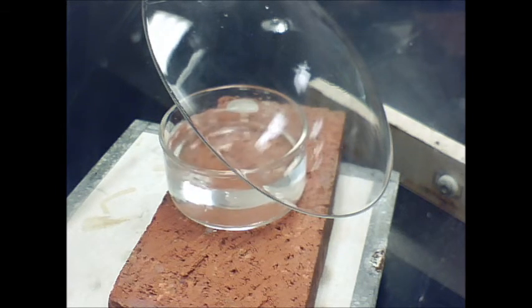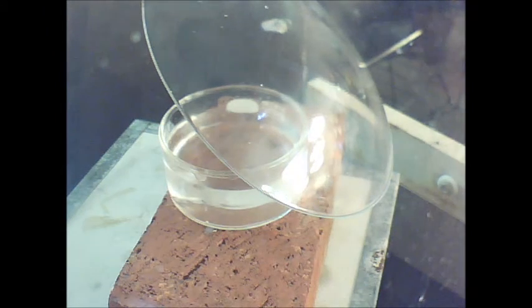Once again, we're getting that reaction with the water, violent reaction. And that's just the metal, nothing but metal that's reacting there. If you look closely, you can see how it's glowing a little bit. It doesn't have quite as violent a reaction as the potassium did.